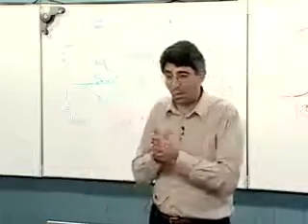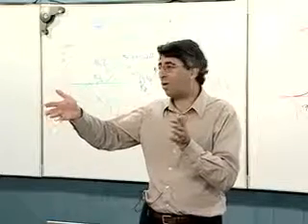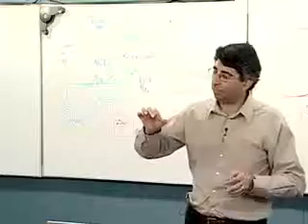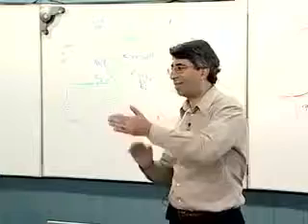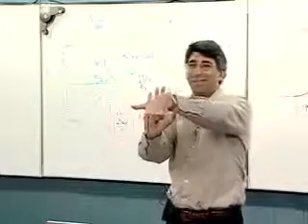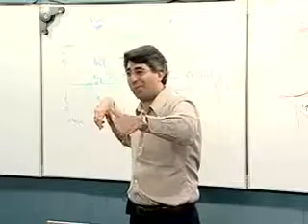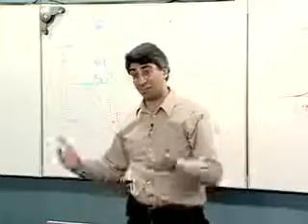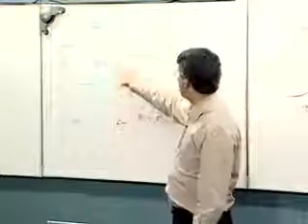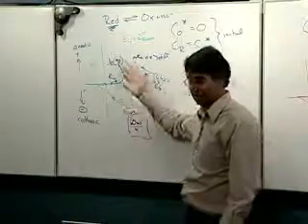Or simply having your working and your reference electrodes too far apart. Or if you were to design a working electrode, say that was a flat square centimeter or something, and you covered the back so it was insulating, and you faced that working electrode towards the edge of your beaker, that's your electrochemical cell, and then you put your reference electrode at the other end of the beaker to the back of your electrode, you can induce high uncompensated resistances, and to the extent that you do that, even before it starts to do really ugly things, it will affect your peak-to-peak separation here, which is an important diagnostic, but it's resistance that you're measuring.